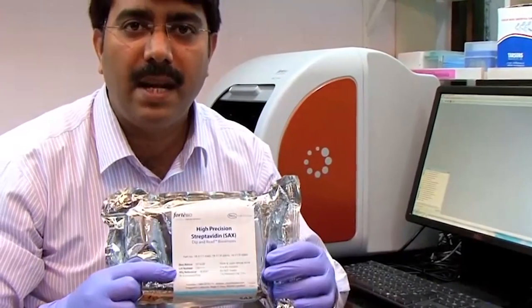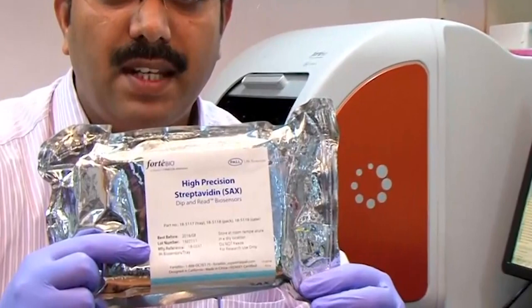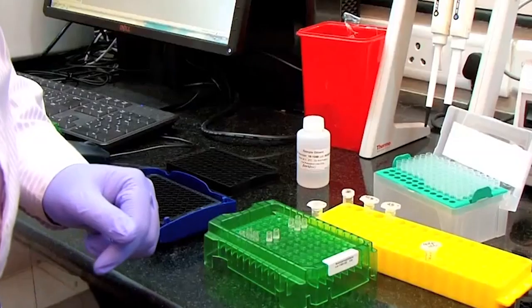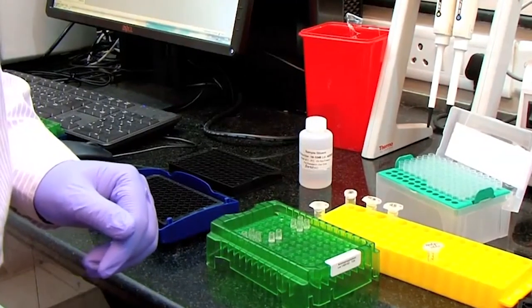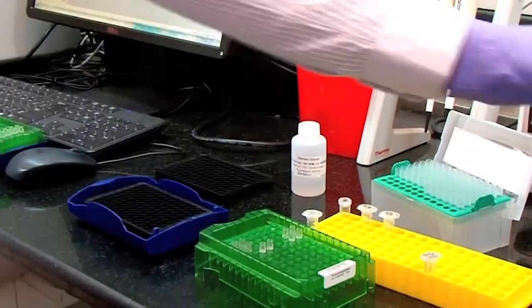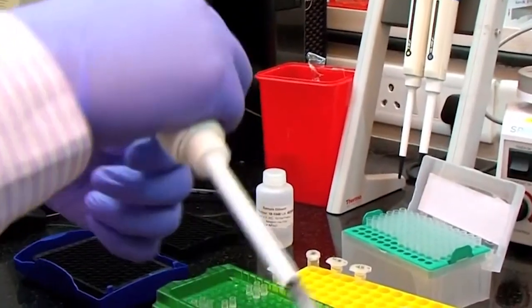I'm going to demonstrate the quantitation of apolipoprotein using an antibody against the apolipoprotein. The biotinylated antibody I'm going to use for immobilization onto a streptavidin sensor. This is the streptavidin sensor I am using for the immobilization step. The streptavidin sensor has to be hydrated before the immobilization. Now I am going to do the hydration of the streptavidin sensors.